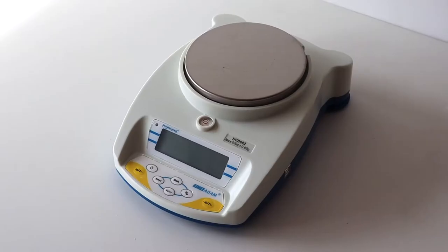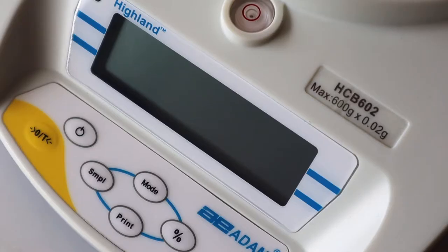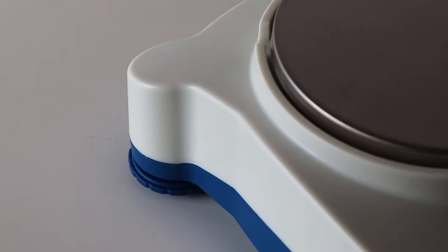This is Adam Equipment's Precision Balance, the Highland. This high-accuracy portable device is from Adam Equipment's large range of analytical and precision balances.